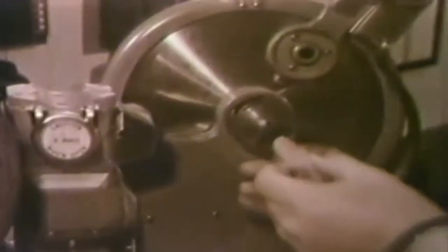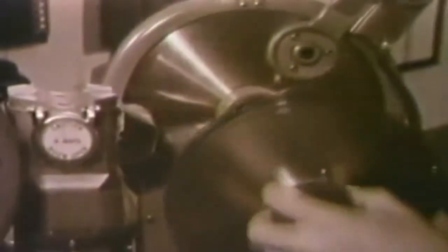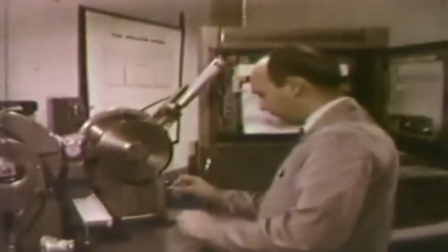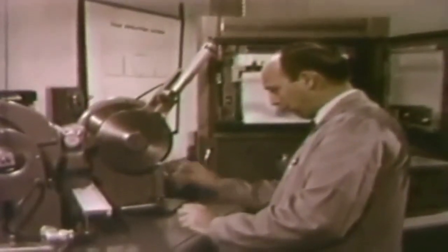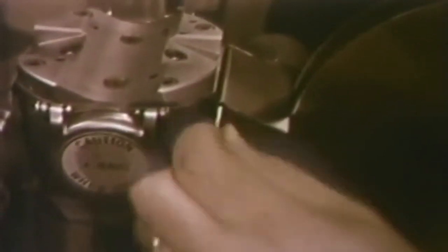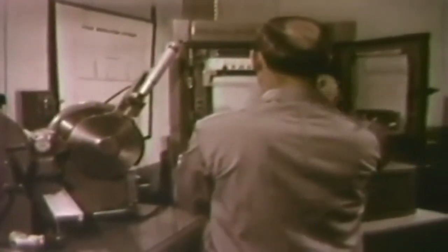The X-ray diffractometer analyzes the crystalline structure of materials and can identify combinations of elements known as compounds. This supplements spectrographic examination, which can only identify elements. The X-ray diffractometer is also employed for the analysis of minute amounts of complex byproducts found near a suspected bombing.